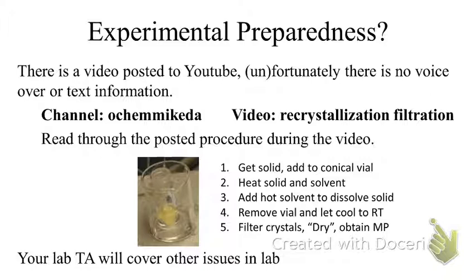Once it completely dissolves, what do we need to do? We should cool it down so that we can get our crystals to precipitate back out. Okay? If you're lucky and you watch that carefully, you can actually see the crystals start to form. It is actually kind of neat to see them crystallize. You now got crystals inside a giant solution. What do you need to do? Filter. You can dry by keeping your filtration system running to try and pull more moisture out of it. You can then obtain a melting point. Why would you obtain the melting point?